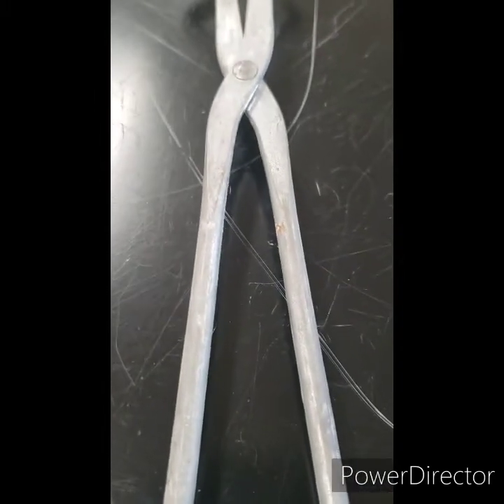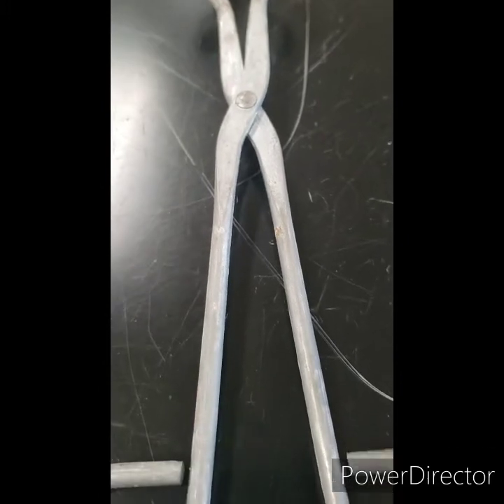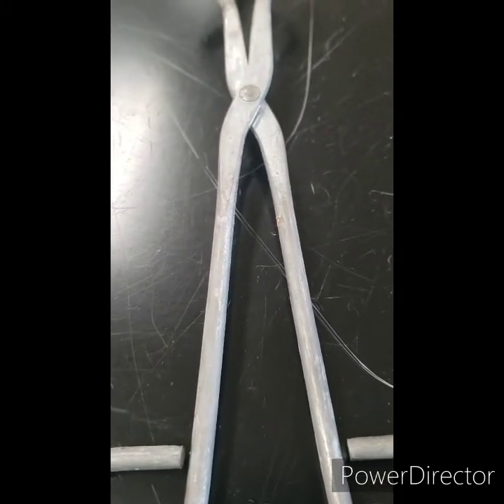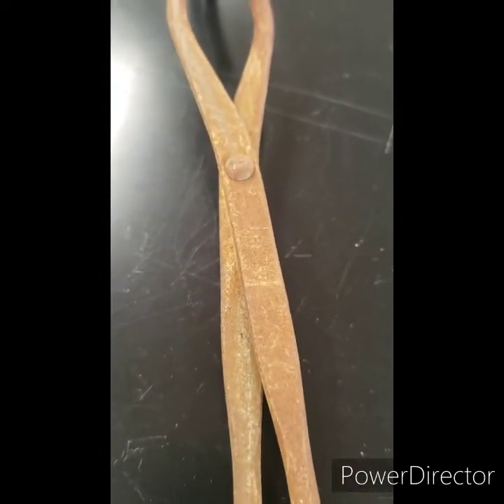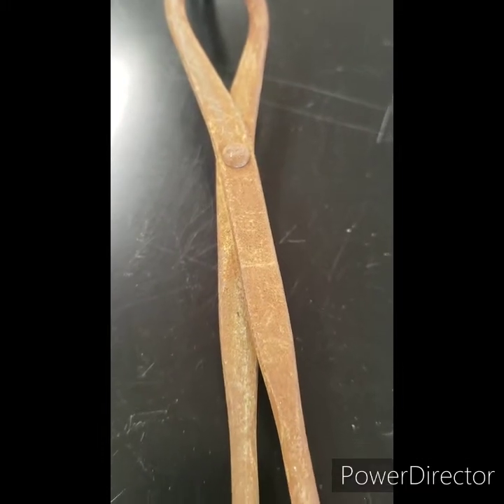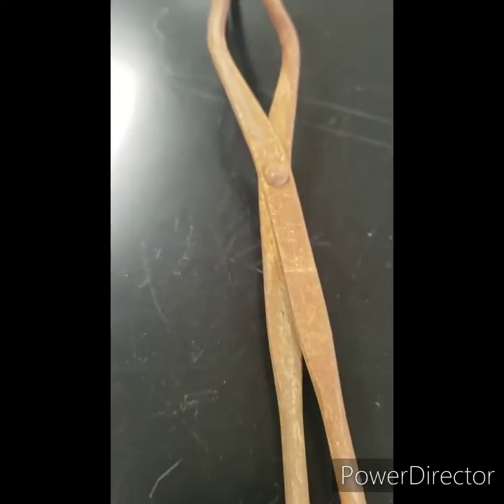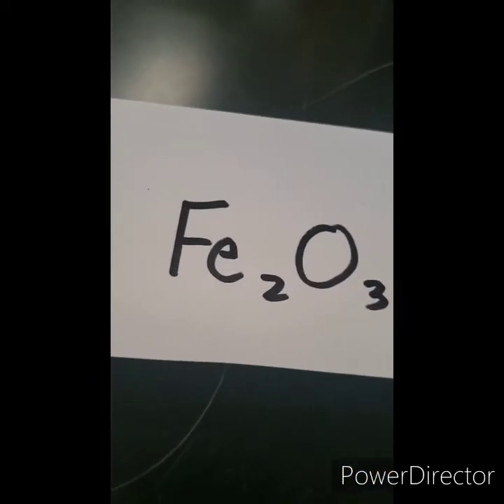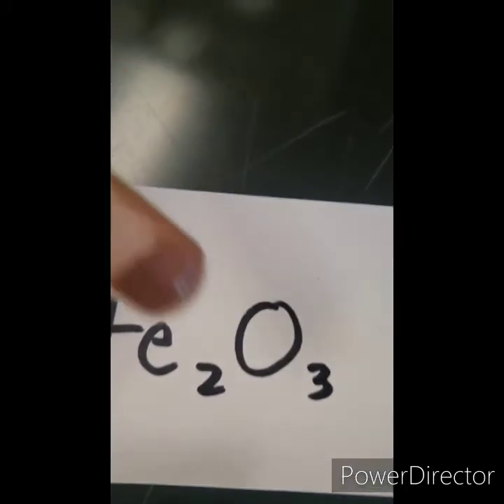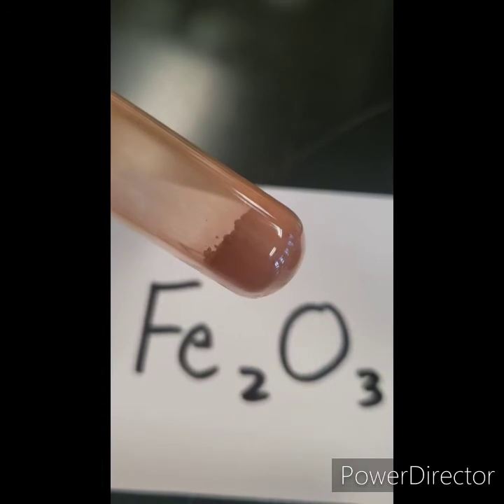These tongs are made of iron — it's an iron alloy. They're silver and shiny. Here are some tongs that have rusted. See how they're different? They're an orangish color and the rust is powdery — it comes off on your finger. Now here's an iron compound: iron 3 oxide. Look at that color — it's orangish, brittle, and powdery.